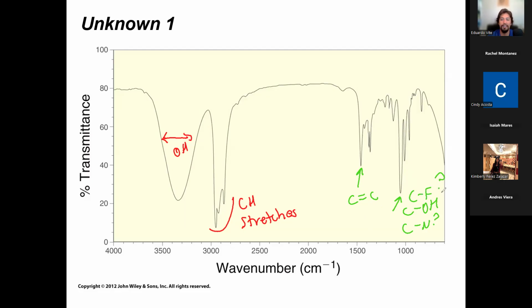So this is why you look at these peaks at the end. You're like, yeah, they're there, maybe. But at this point, we would need more information. We would need the formula. We would need a picture of the structure. It becomes more difficult to guess that with certainty. The OH, that's distinct. That's why we focus on it. So again, this isn't 100% definitive. You don't have to look at all of the peaks. Just find the ones you're familiar with. But the more peaks you're familiar with, the better you get at doing this, right? So it also helps.